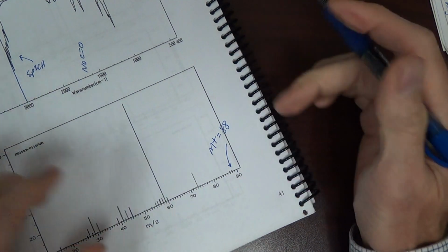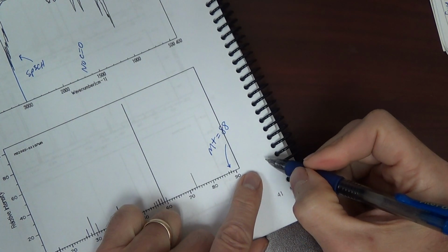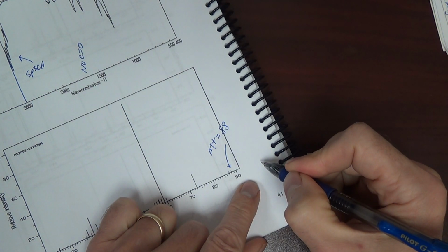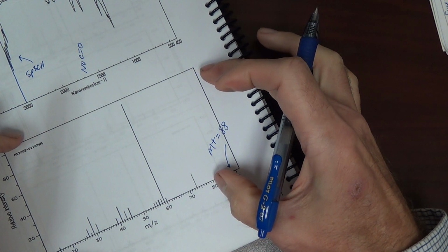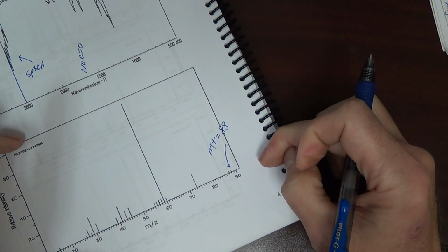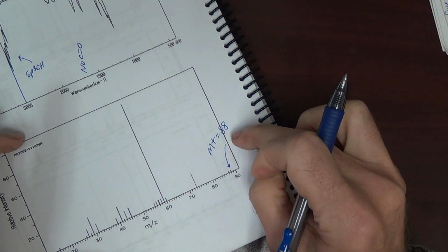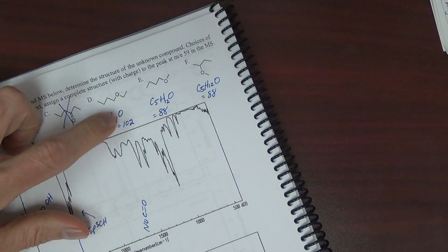Whoever generated this, if there was a peak there, I assume it would be shown. If there's not a peak there, it could be that it's just not shown and the molecular ion was just not present. Seems though that the molecular weight may be 88. Thus we may be excluding this one here.